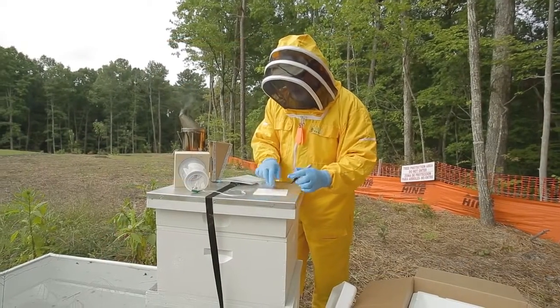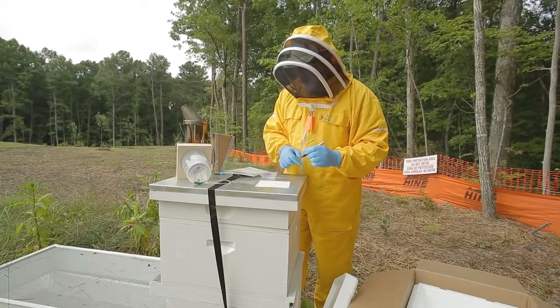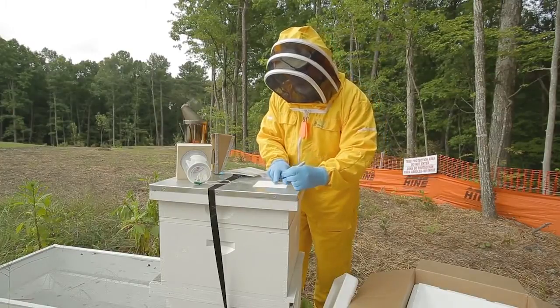Before collecting bee samples, step one is to gather and set up your materials and equipment. You will need beekeeper clothing and equipment such as a bee suit, gloves, smoker, and hive tool.